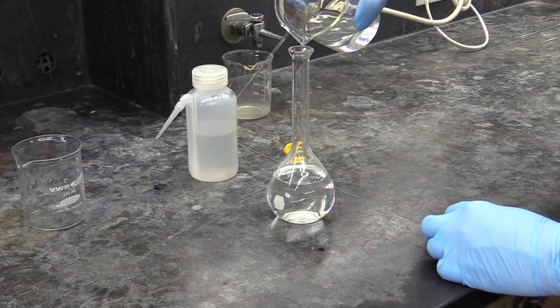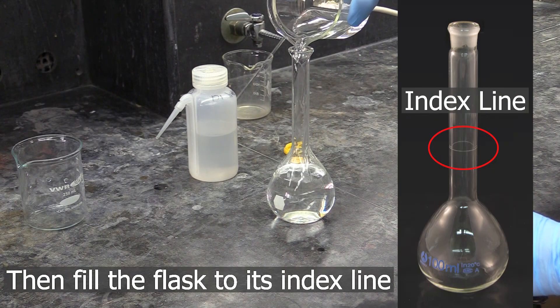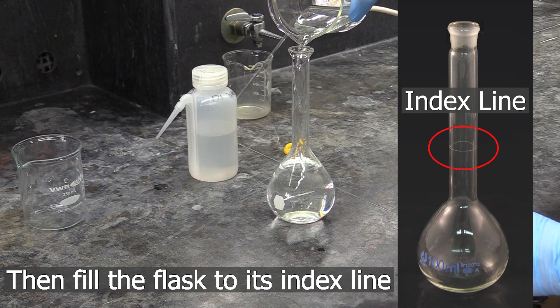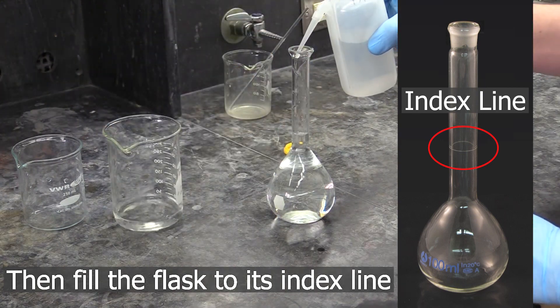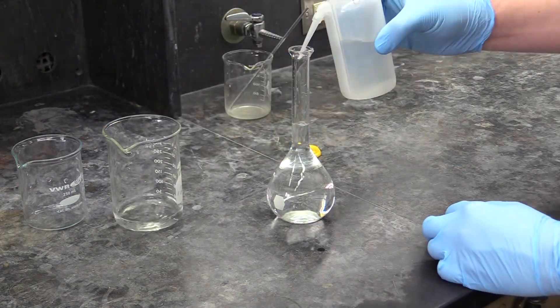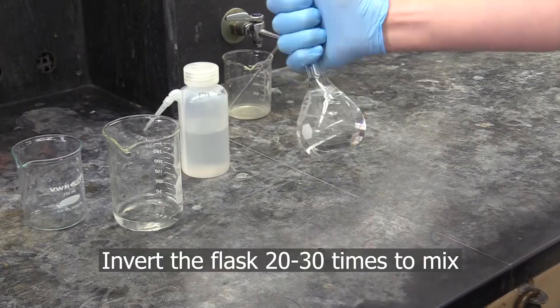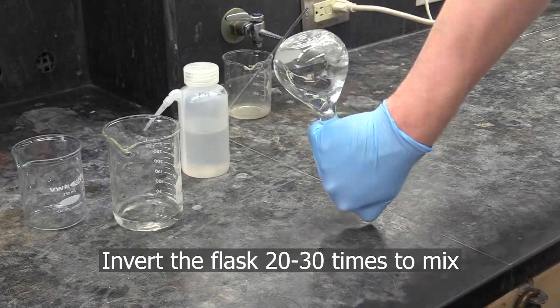Next, use more DI water to fill the flask to its index mark, which is this frosted band around its neck. Be careful when you do this, the level rises quickly when the liquid gets up into the neck. And finally, invert the flask about 20 to 30 times to thoroughly mix the contents.